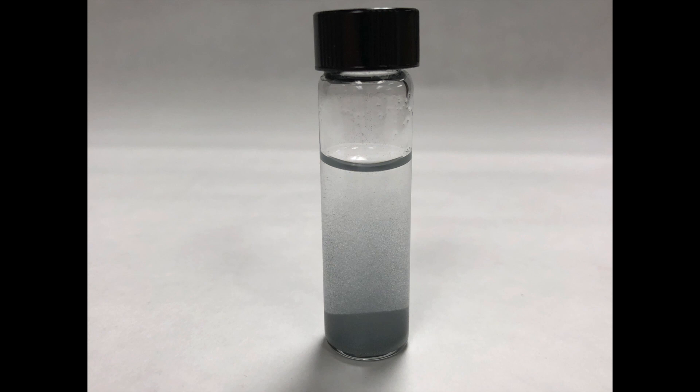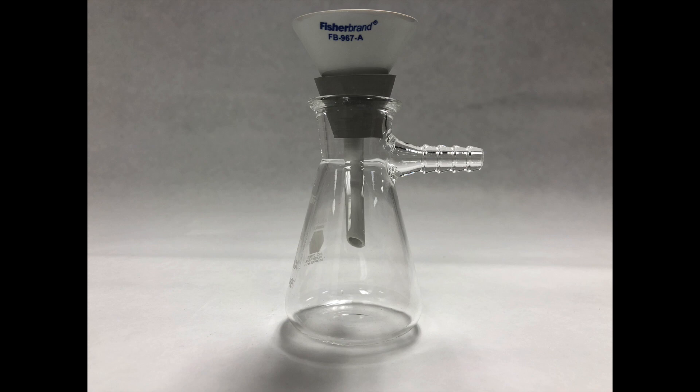In this video, you will learn how to perform vacuum filtration to separate a solid-liquid mixture using a Hirsch funnel. Using vacuum filtration, the liquid part of your solution, called the filtrate, is forced through the filter paper using suction, leaving the solid, also called the precipitate, in the funnel.